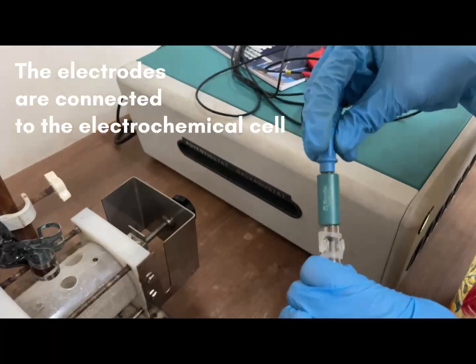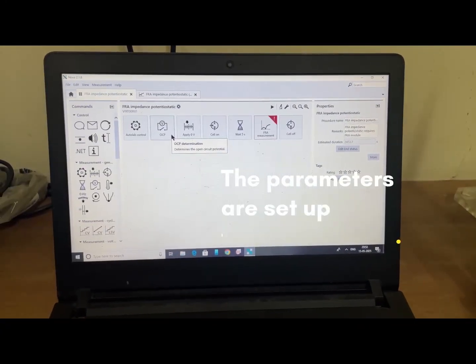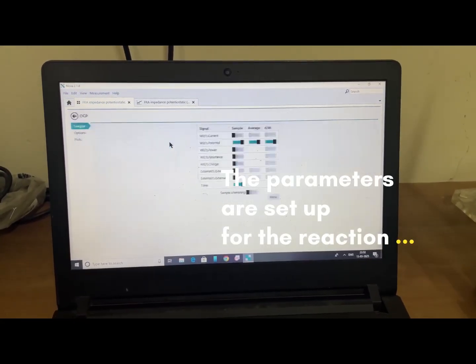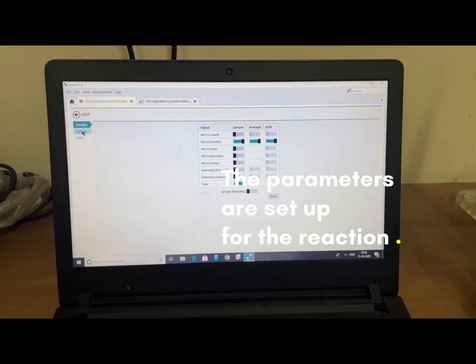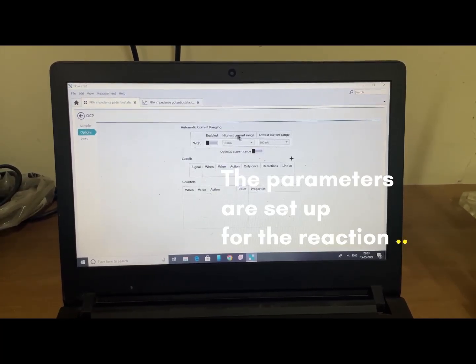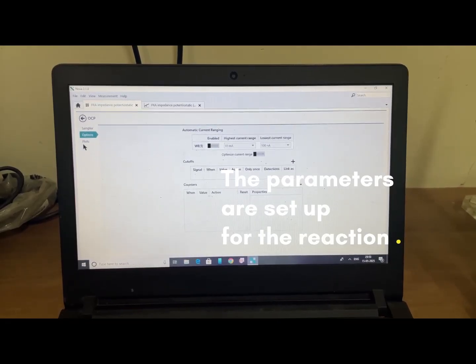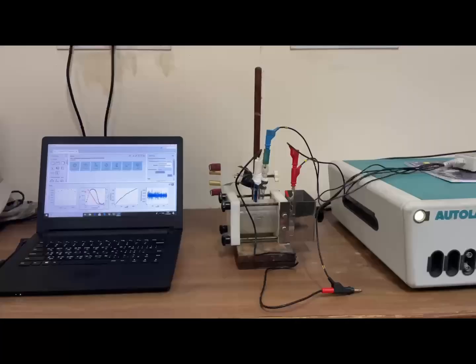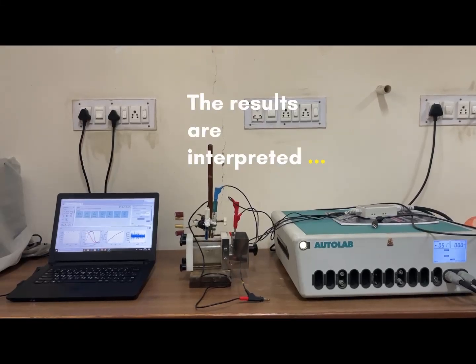to the electrochemical cell, and using the software you can fix the parameters. So the potential and current values are fixed in the software. Then the equipment is started. Then the results are interpreted.